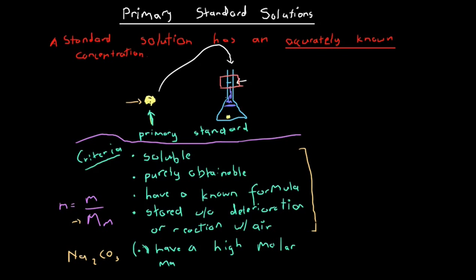Okay, we call this arc that is formed at the top of the solution a meniscus. Fill up any container with solution or with water, it kind of forms this arc. Okay, the surface isn't actually flat. And so when we say fill the flask up to the line, we mean fill it up until the bottom of this meniscus arc, okay, so this point here, is sitting on top of the line. Okay, so the bottom of the meniscus has to sit on the line. Okay, just like we've shown here.